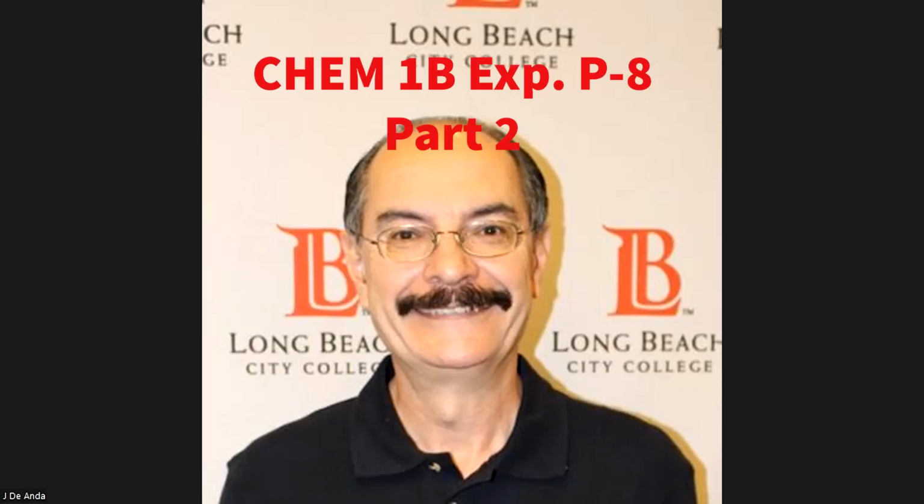Hello, students. This is Dr. DA, and I'm going to try to help you here with the experiment you just did, where you synthesized a coordination compound, and now you are asked to analyze for its percent copper and for the ratio of ammonia to copper in the compound. So let's go ahead and start with the first one here.